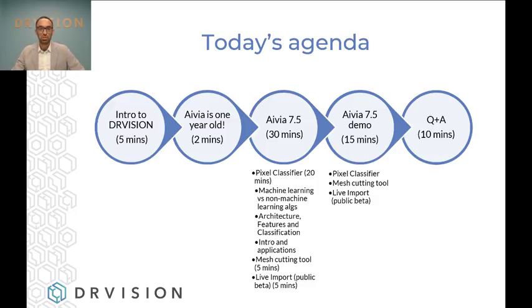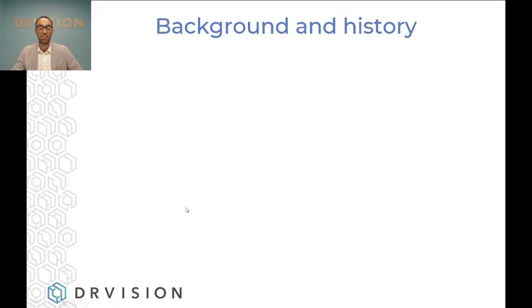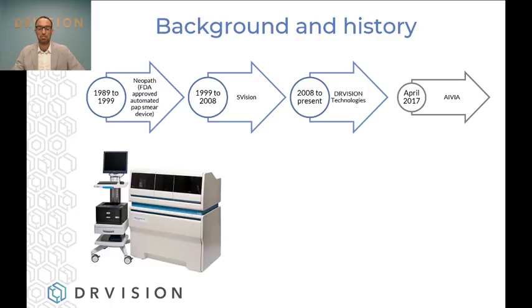We were working on this new release for about 2 months, and we're really excited to bring you these 3 major features, and we actually have quite a few more. You can read about them on our website and in the release notes. But for now, let me give you a brief introduction of DRVISION, because I know it's still not as well known as other companies in this space of machine learning and image analysis. So let me give you a little bit of background.